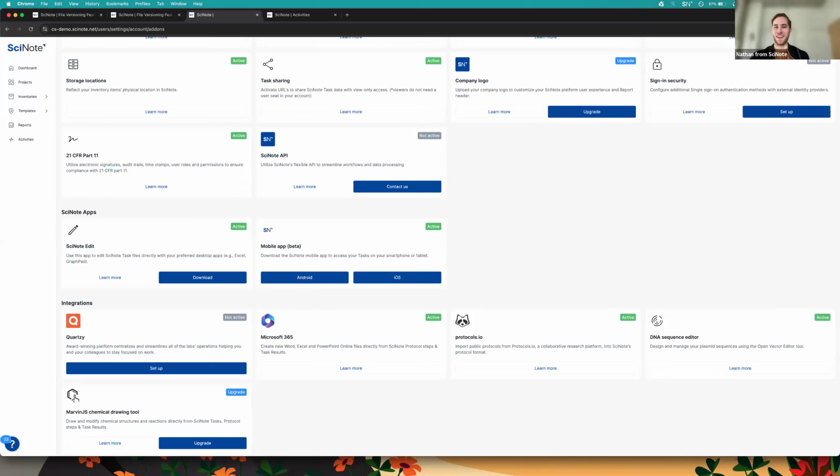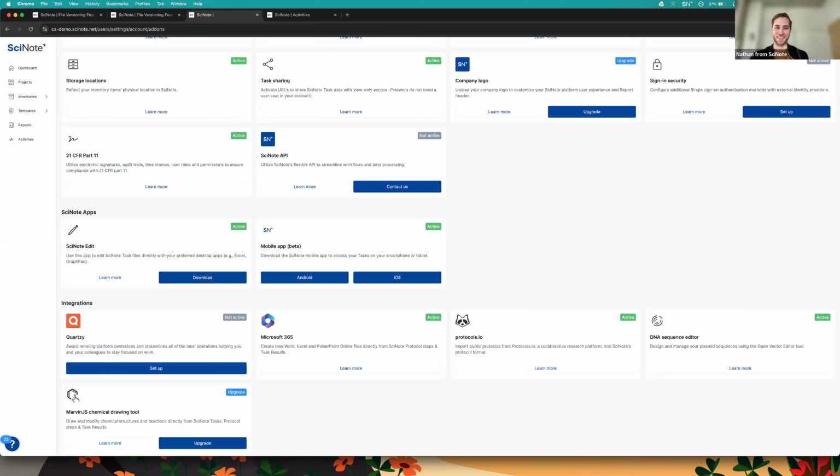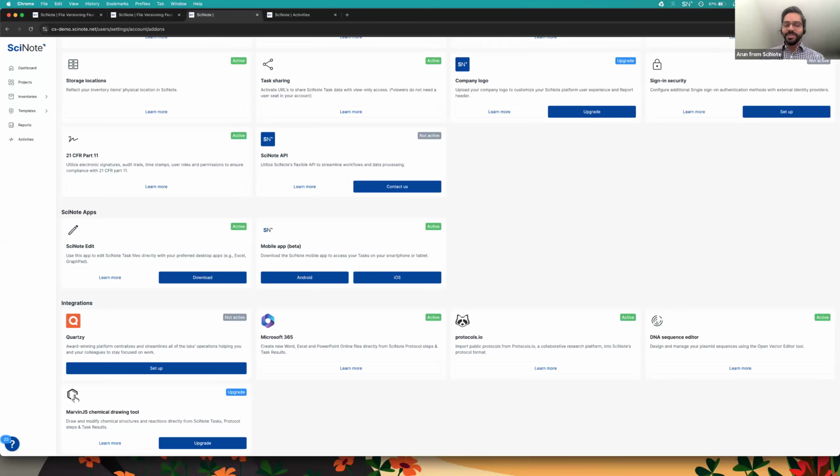And if that's a little bit difficult to visualize, we can also show you an example in the portal as well. Yeah, and if our answer didn't answer the question, please feel free to write to us directly. Christina will be happy to answer a question by email or maybe even set up a quick meeting to go over it.